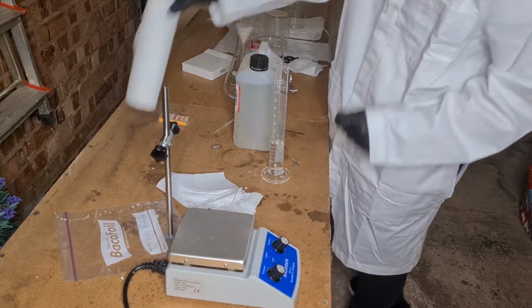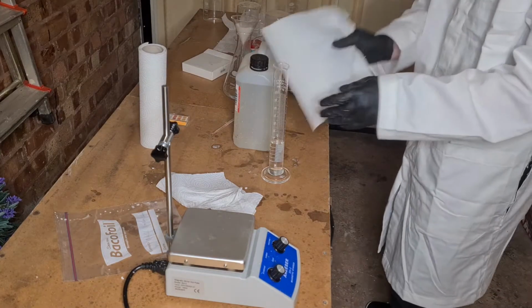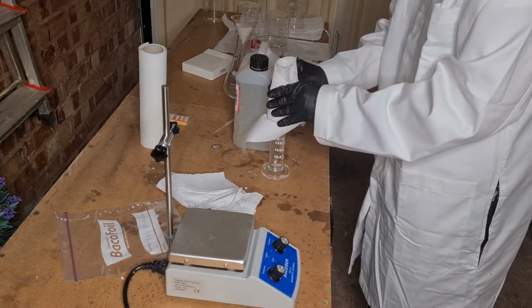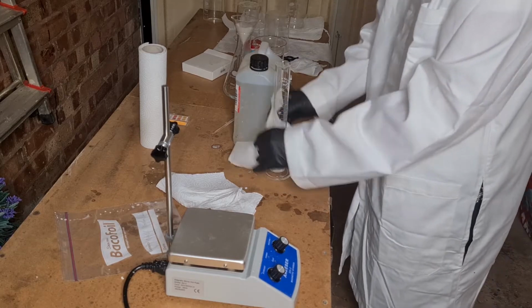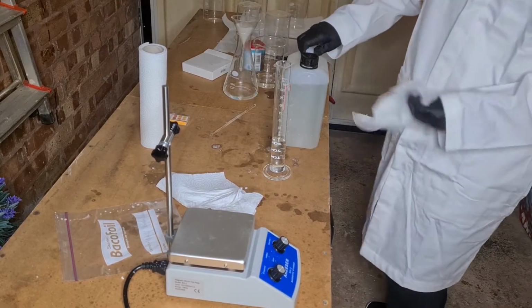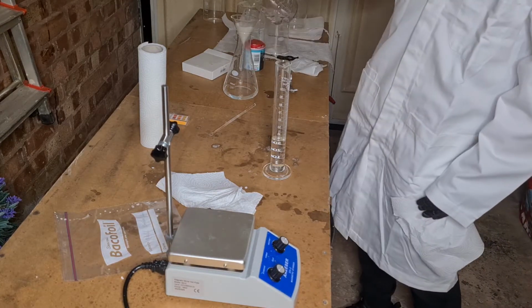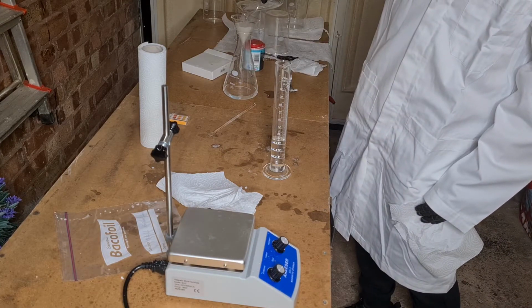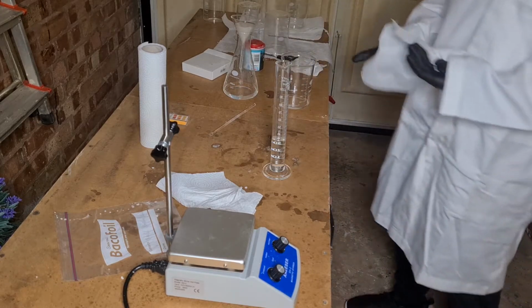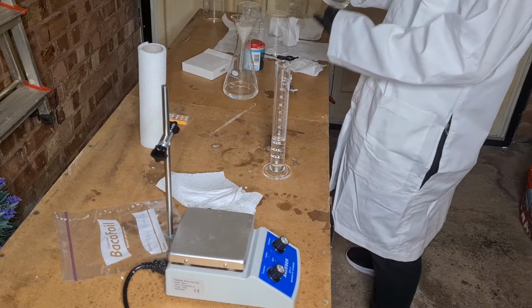And also, I'm going to clean the outside of that because I have realised that there is hydrochloric acid on the outside. That's not ideal. This is the boring side of chemistry, cleaning up your own mess. So just put a bit more through here. Some of it may make it around the filter, that's not ideal, but ideally it doesn't. And just the last bit of water.